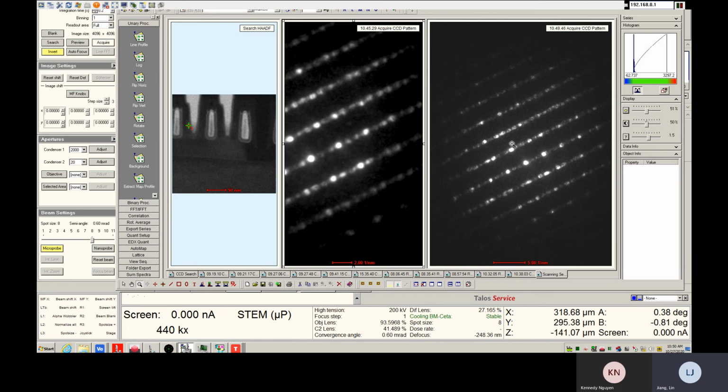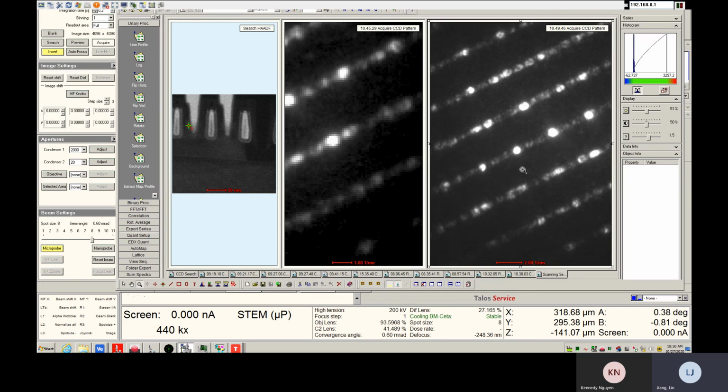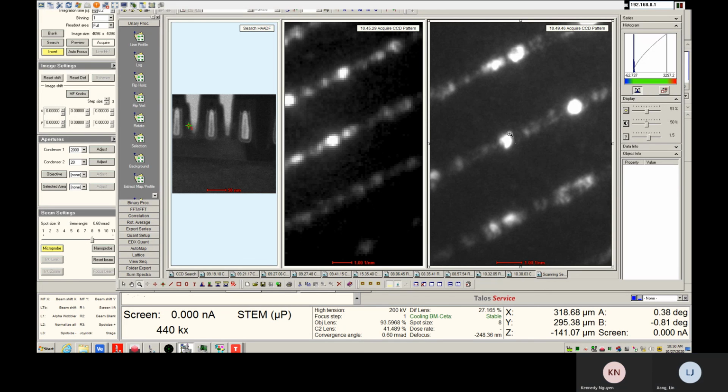From 4K, you can get a much clearer image, right? Once you zoom in, you see here is a pixel, but for 4K, you zoom in and you still see a good, clear image. That is the benefit of taking a 4K image.